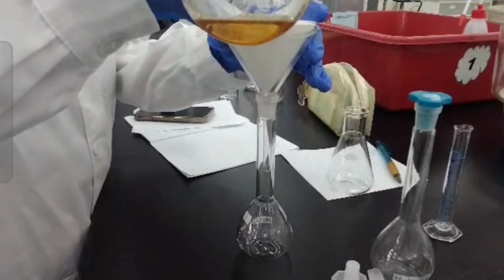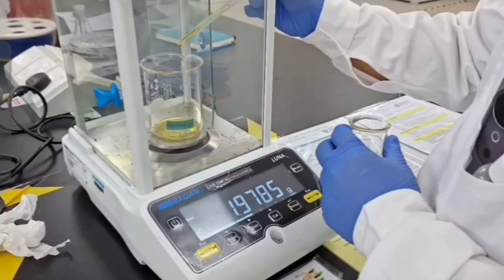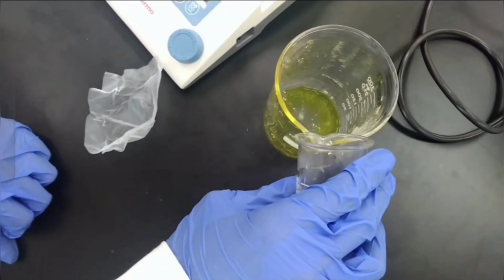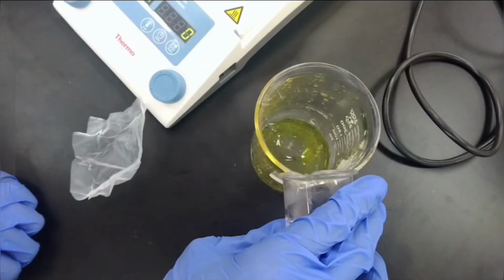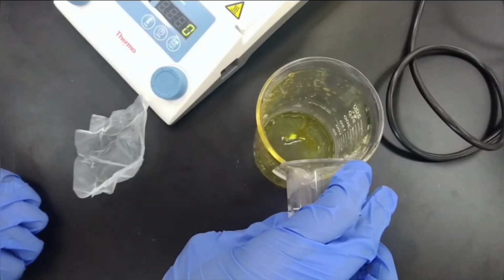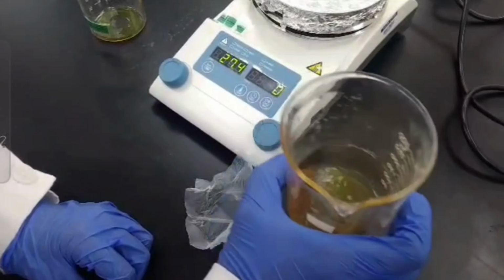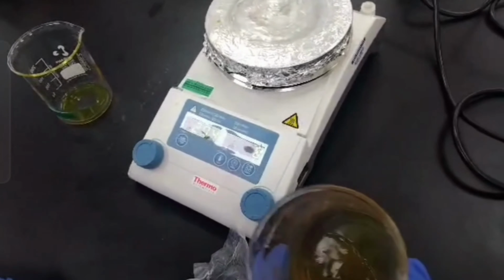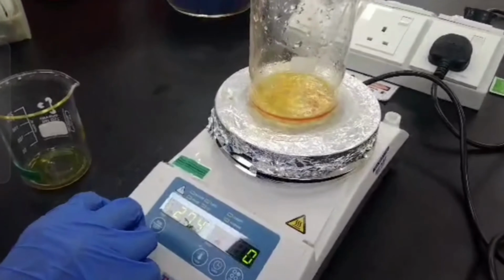First step, we filter our used cooking oil using a filter paper. We weigh 2 grams of used cooking oil for our experiment, as you can see there. Then we add 10 milliliters of concentrated nitric acid to the beaker filled with 2 grams of used cooking oil. Then we put the beaker on top of a hot plate.